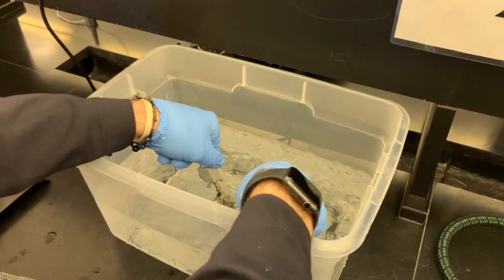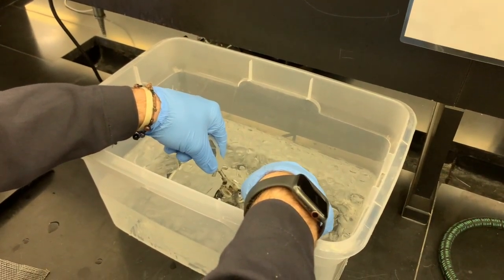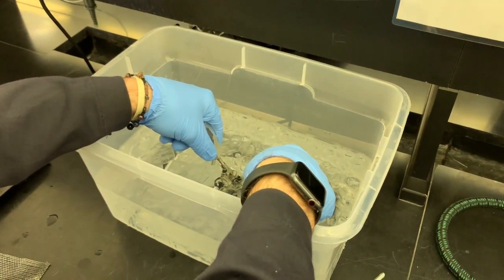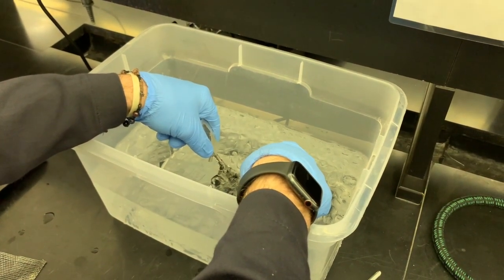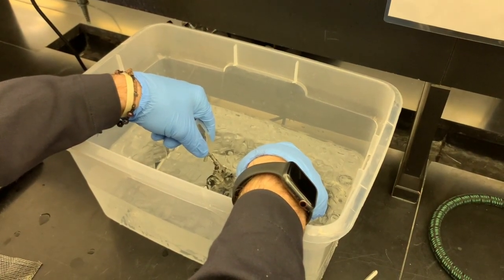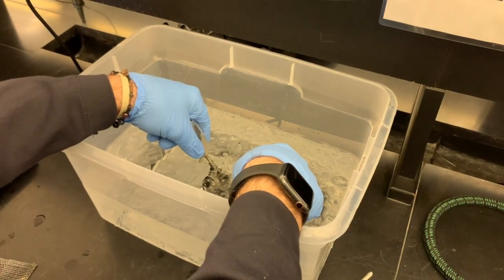When it comes to any kind of ice water, you can be confident that you're not gonna change the temperature of the water too much because the ice is gonna stabilize that temperature. It's gonna stay put. You're not gonna really lose any of those degrees Celsius because the water is going to be instantly cooled back down by the ice.